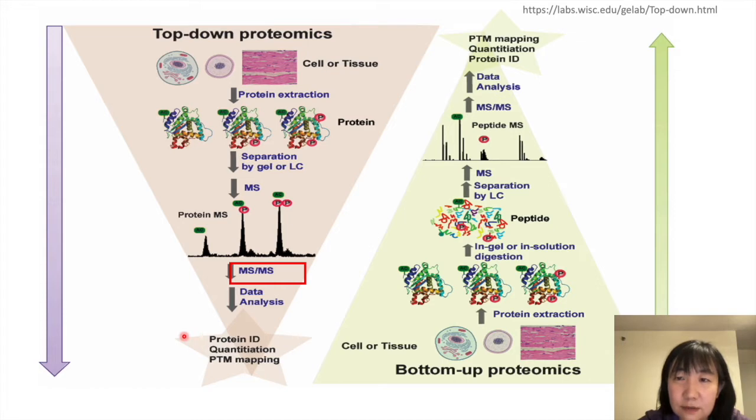The most critical steps of top-down proteomics are separation, mass spectrometry analysis, and data processing. For the mass spec part, we have already known that for top-down proteomics, we need the instrument with extremely high resolution to measure the molecular weight of the protein, because the protein ions are always multi-charged. Mostly we use FT-ICR and Orbitrap, but here I'm going to discuss another part, fragmentation.